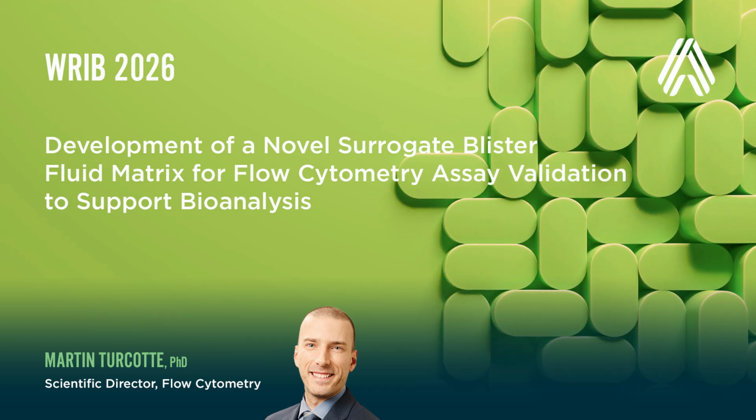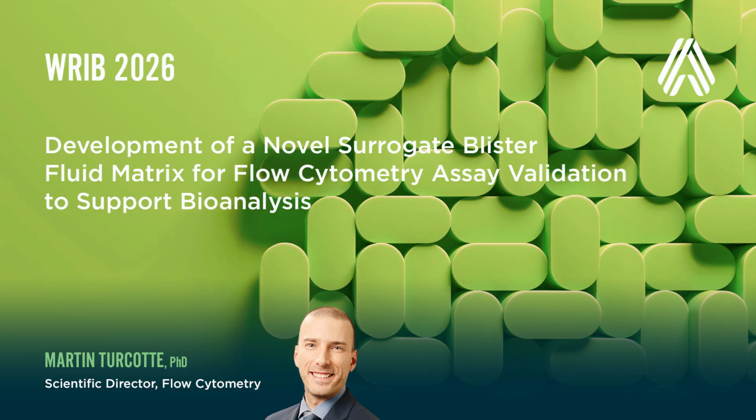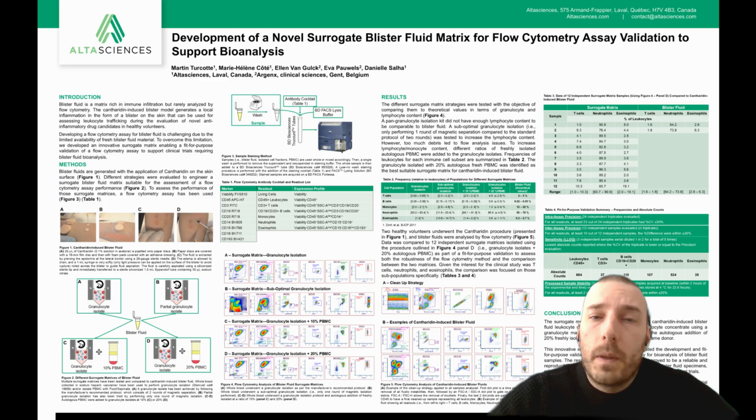Thank you for your interest in my poster, which is entitled Development of a Novel Surrogate Blister Fluid Matrix for Flow Cytometry Assay Validation to Support Bioanalysis, which will be presented at the WRIB 2026. My name is Martin Turcotte, and I'm the Global Scientific Director for Flow Cytometry at Altasciences, and I will give you a brief overview of the exciting work we have conducted in partnership with the biotech company Argenx.